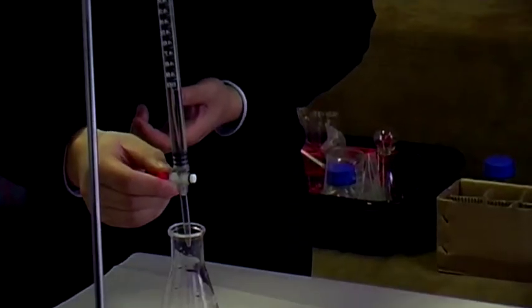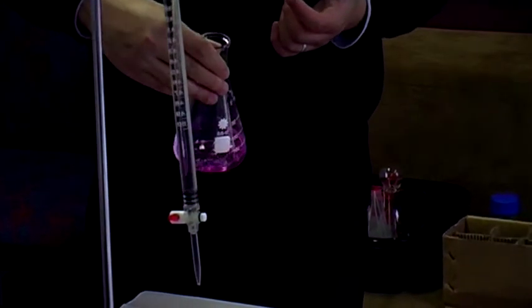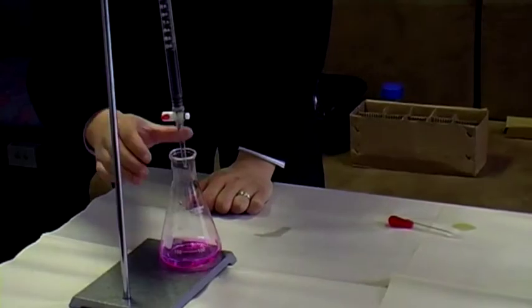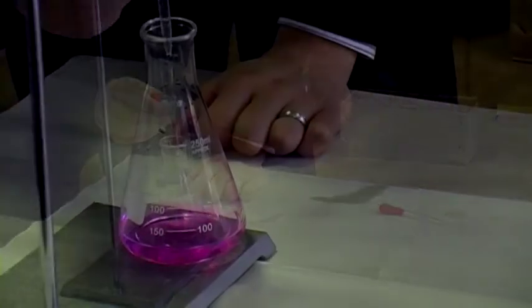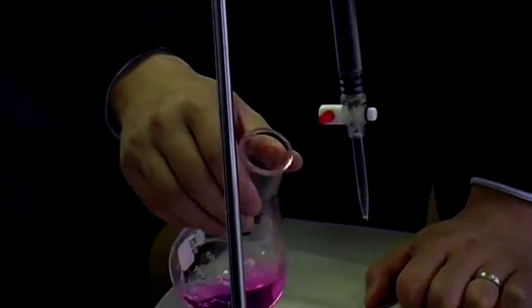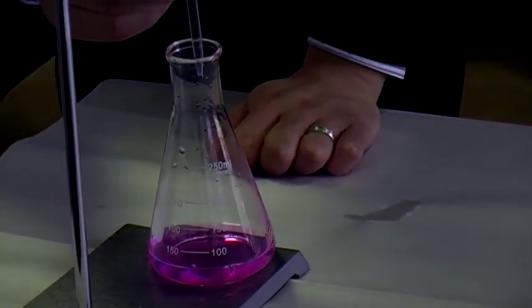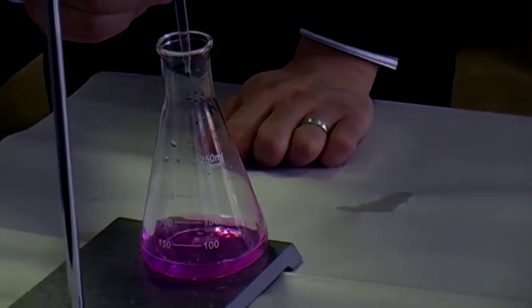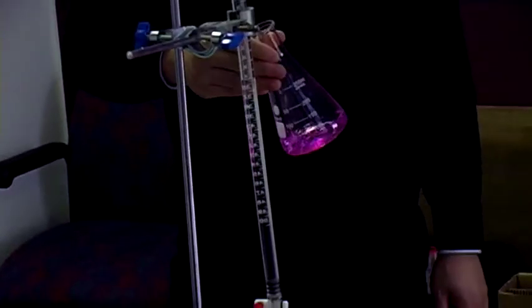It's about 30 now. We'll stop there and give it a swirl. It's still basic, which is exactly what we expect. Let's jump to about 33 and give it another swirl. This is only a rough titration, so I don't need to be too accurate. You can see it's getting slightly lighter pink, which means I'm getting close. At 33 it's still not past the end point. Let's jump to 35 — we've added 20 mLs, which is about what we were expecting.